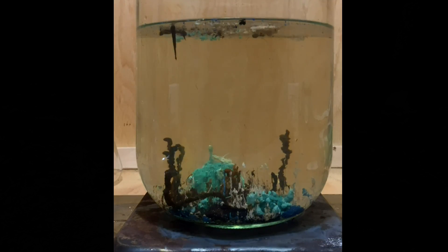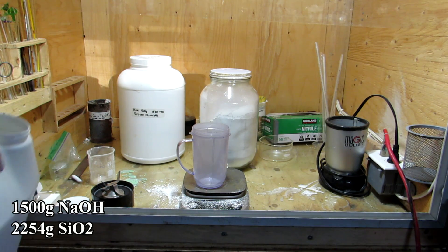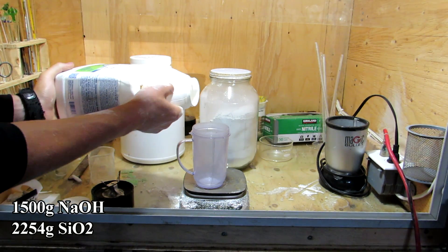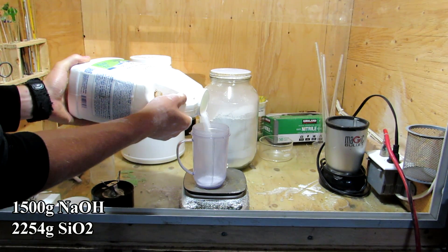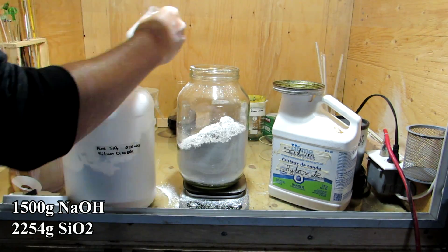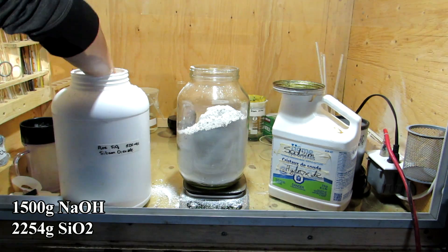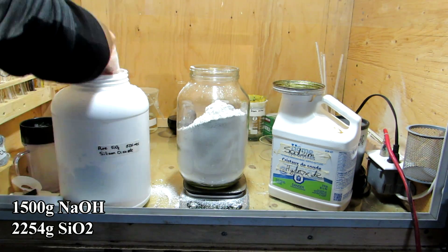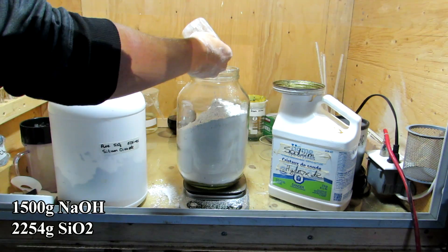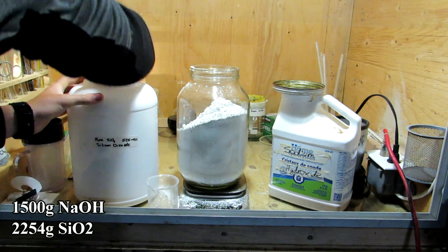To begin, we can weigh out 1500 grams of sodium hydroxide and 2254 grams of silicon dioxide. The sodium hydroxide can be purchased as lye or drain cleaner from hardware stores, and the silicon dioxide can be found from pottery supply stores. Alternatively, the pure silicon dioxide we prepared in a previous video could also be used if higher quality sodium silicate is desired. Beach sand could also be used if the final purity of the sodium silicate is not important.